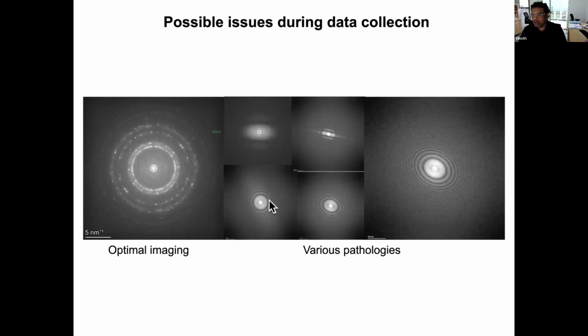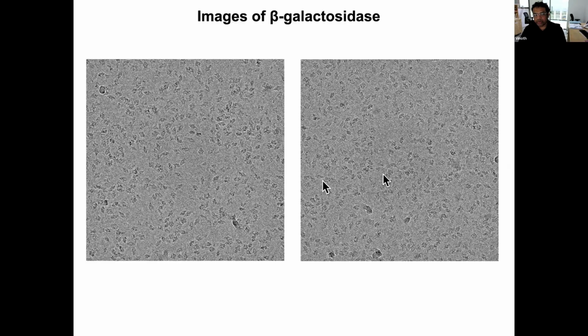One has to go through different places and find where the source is, and it can be very painful and can take a lot of time. Let's say that for whatever reason you have to collect some data sets on this. So it happened to us, and this I think is an example. So here are two images of the same beta galactosidase series, and when I show this to you, you will find that they are both similar. There is nothing, no problem, right?